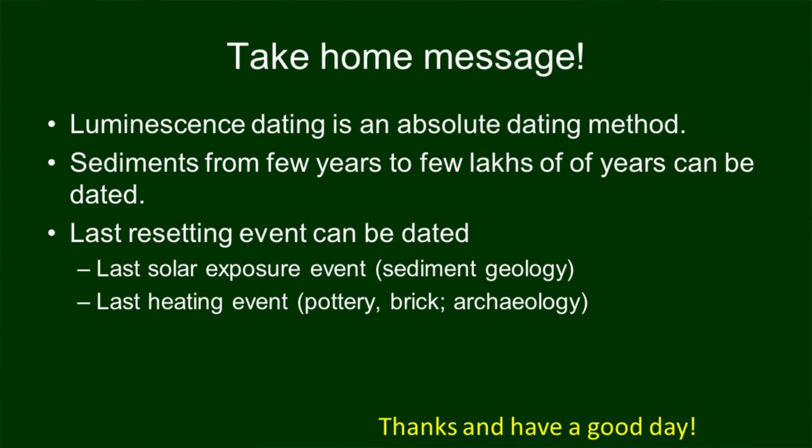The take home message is that luminescence dating is an absolute dating method. Sediments from a few years to thousands of years, up to lakhs of years, can be dated, and the age that we get on the sample is the age of resetting. That means the time when the sample was last exposed to sunlight or heat will be dated.